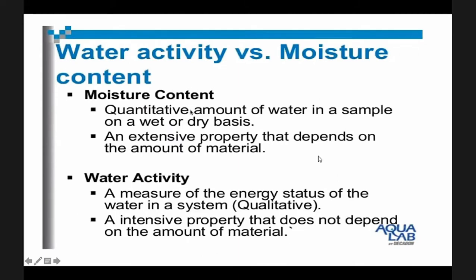Moisture content is the quantitative amount of water in a sample on a wet or dry basis. Class, wet means as-received basis.